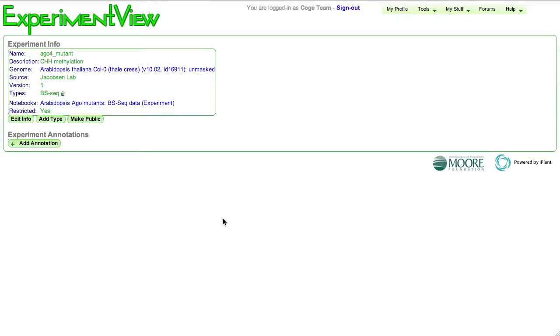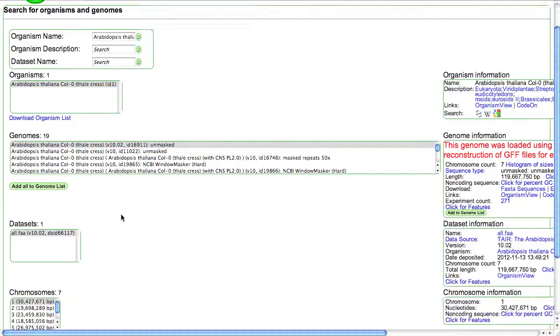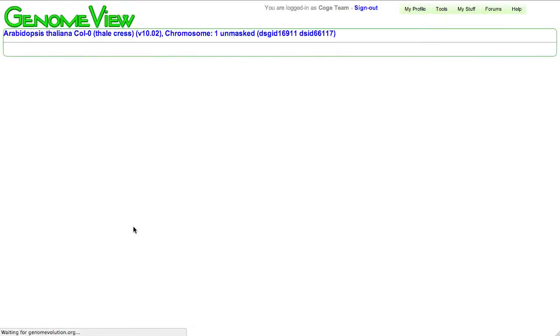I'm going to click on this experiment, get us over to Experiment View, follow that over to Organism View, which allows me now to launch our Genome Browser.